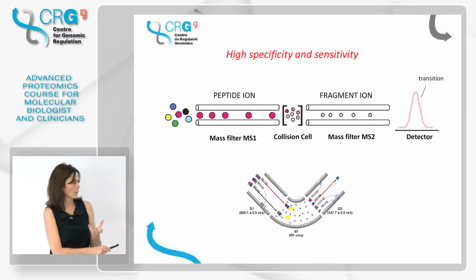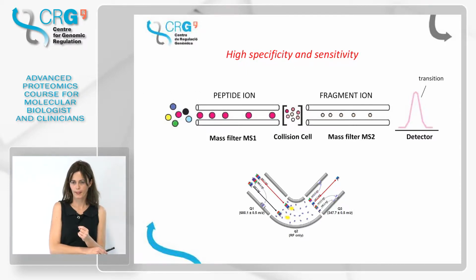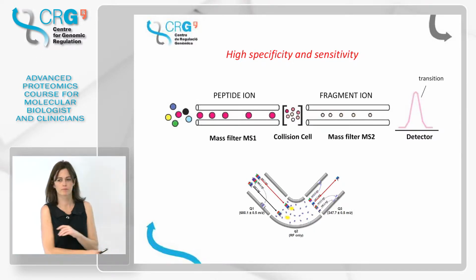This way of operating the instrument makes SRM highly specific and highly sensitive. Yes, we are going to see this. Okay?